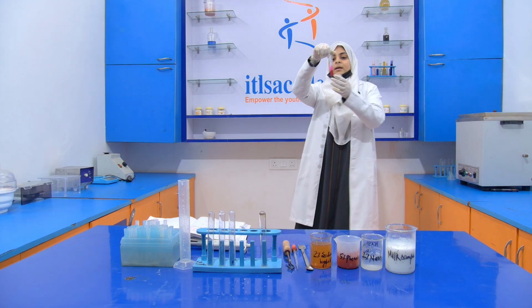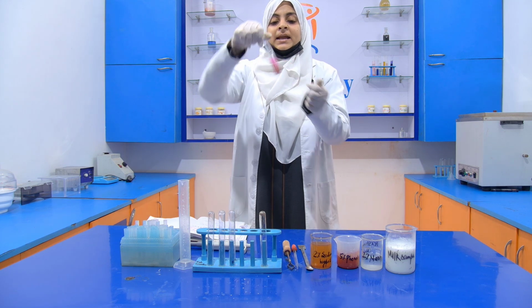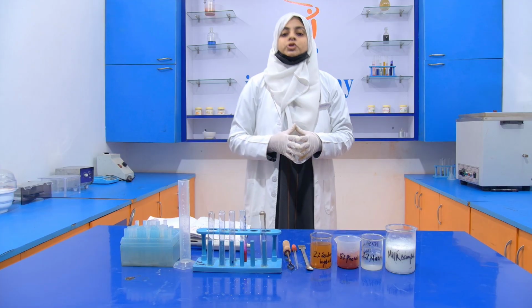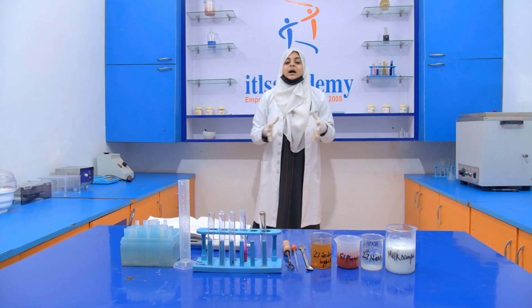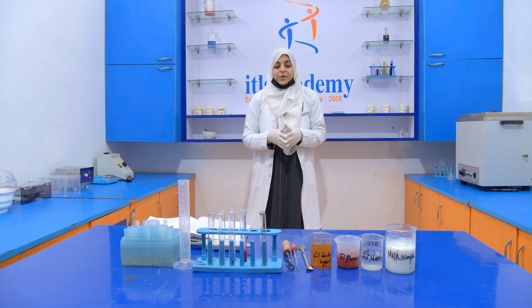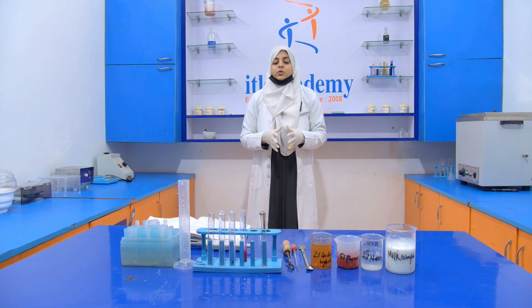See that it is still pink in color. We don't get any deep blue color, which means that our sample does not contain any ammonium salt, or you can say that our sample is pure. So this is all about the detection of ammonium salt in milk.